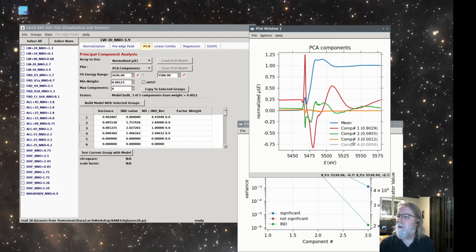And in fact, if we look at each of those individually, those are the mean in the first 2, and then this third one here is maybe, depending on whether that's going to end up being important. So for sure, we see that there are 2 components and then maybe a third for this data set.